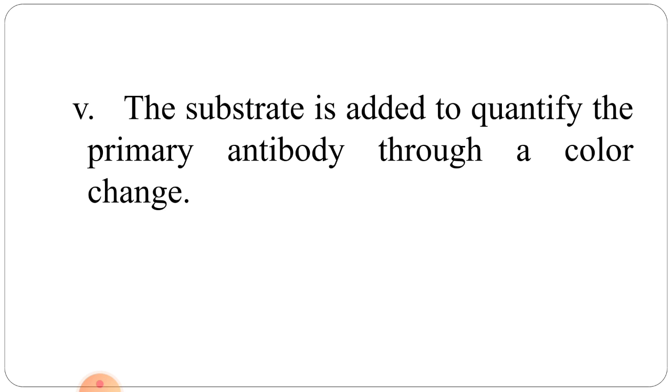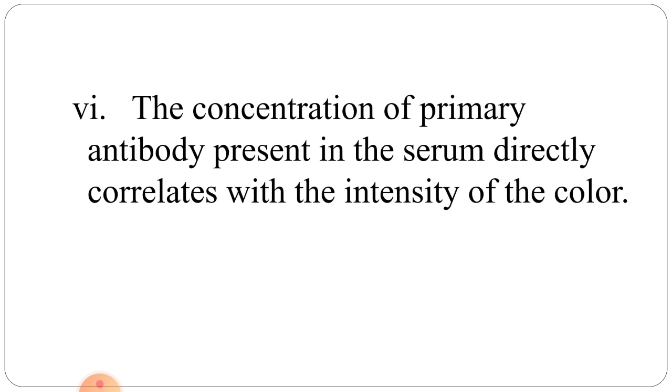The substrate is added to quantify the primary antibody through a color change. The concentration of the primary antibody present in the serum directly correlates with the intensity of the color.